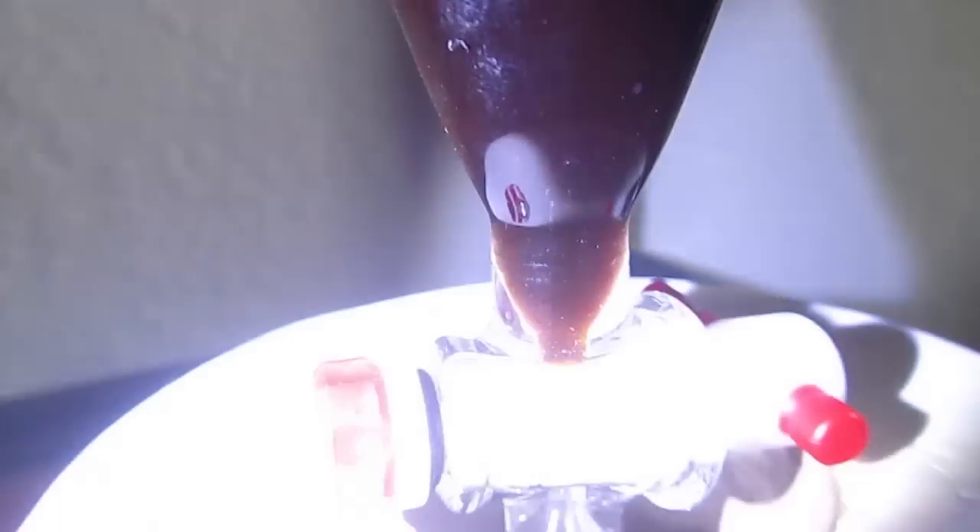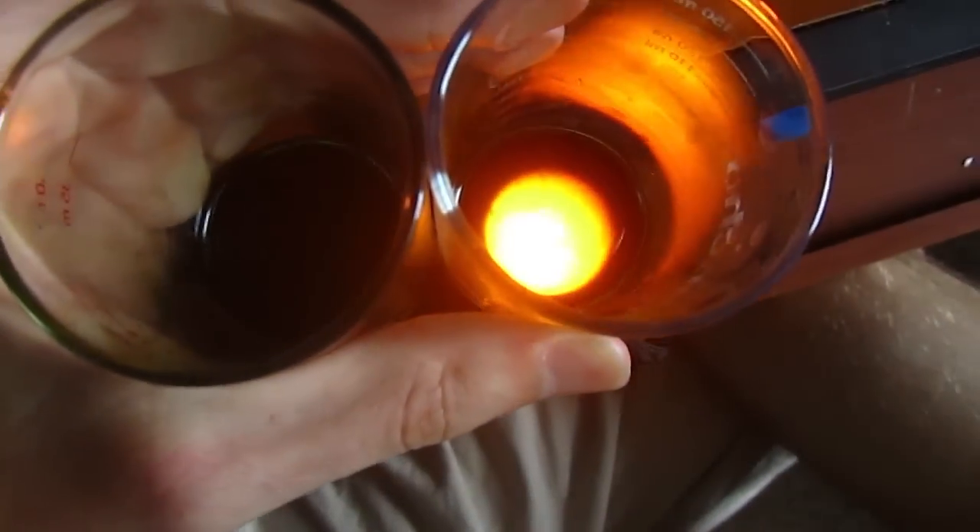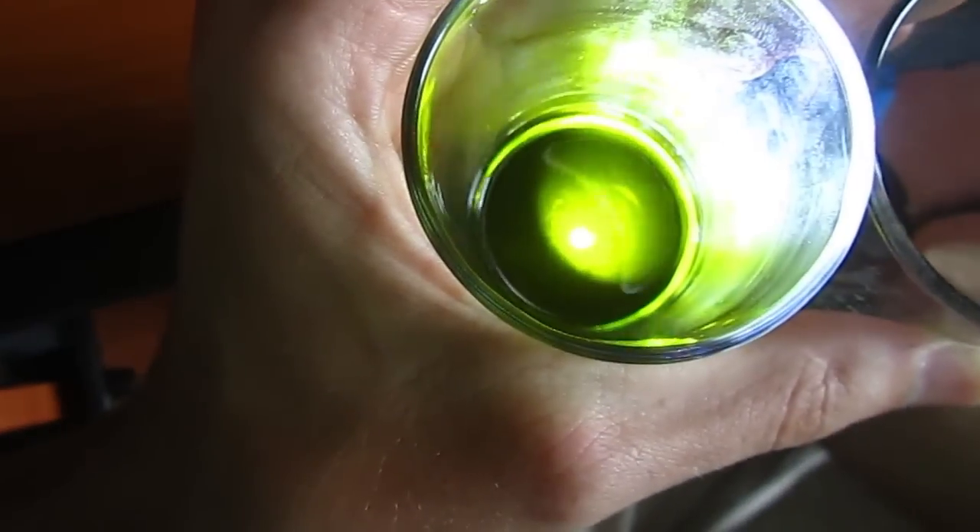A little bit of the capsaicin dissolved in the petroleum ether, but most of it remained in the capsaicin oil, which I poured off. You can see here — this first one contains the capsaicin oil, and the second one contains chlorophyll and other stuff along with the petroleum ether. And this stuff was hot! It burned my mouth for 30 minutes with just one drop. So thank you!